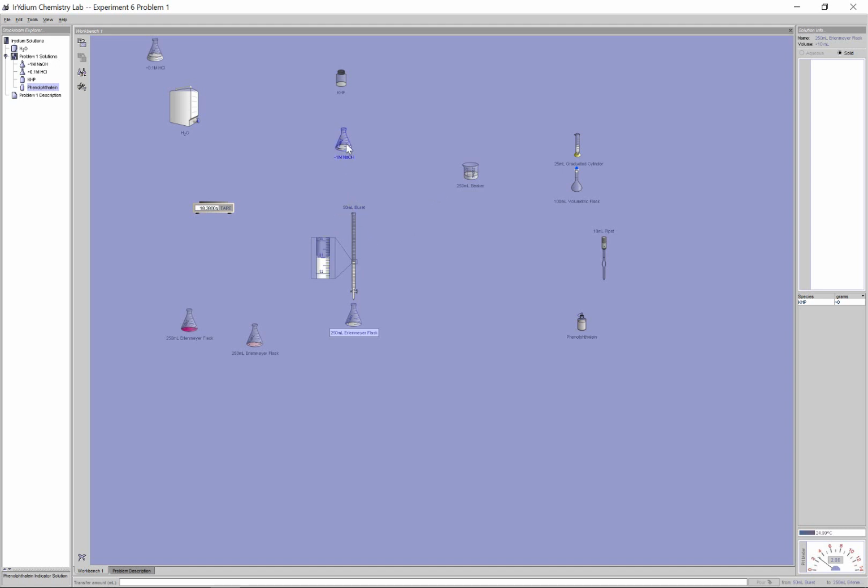So I'm going to take my NaOH solution here. Let's reload it with another maybe 20 milliliters. Let's just be safe, right? I just want to show you that you can reload if you're not in a titration. All that's going to do is change my starting volume. So my starting volume, just coincidentally, ended up being 11 point something again. This time it's 11 point maybe 0.02 or so. It's okay to reload in between, but while you're doing a titration, you're not allowed to reload or else it's going to introduce error.